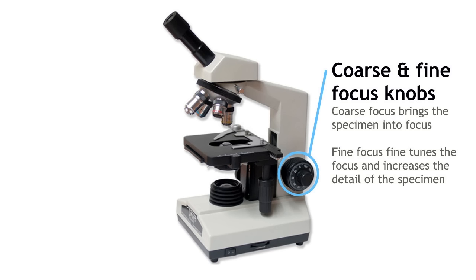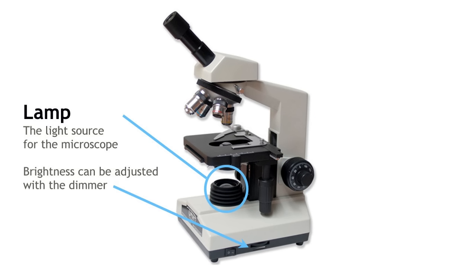The coarse and fine focus knobs move the stage towards or away from the objective lenses depending on which way it is turned. The coarse focus knob brings the specimen into focus. The fine focus fine tunes and increases the detail of the specimen.